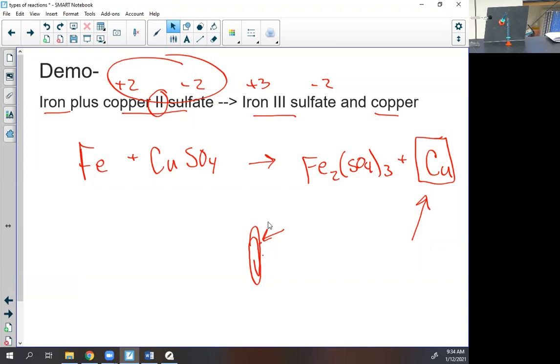I'll show you. So my hands are mostly clean. I say mostly because they're not perfect, but you can see now it's a lot more brown than it was. But the copper's just sticking to it. Not as brown. And there it is on my fingers. This is just copper.